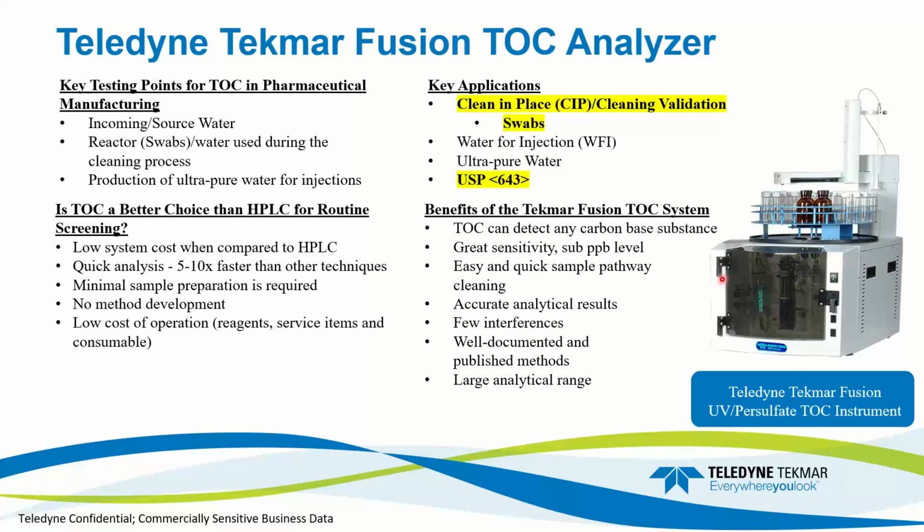As we look around our pharmaceutical manufacturing laboratories, we'll see many different types of systems. A lot of the manufacturers actually have many HPLCs out there for routine screening. So, is TOC better than HPLC for routine screening? We'll find out later in this presentation, but at a high-level overview, it's a low system cost. TOC has a low system cost compared to HPLC.